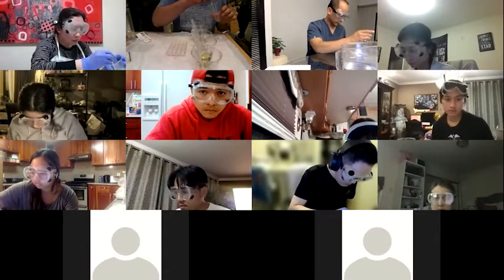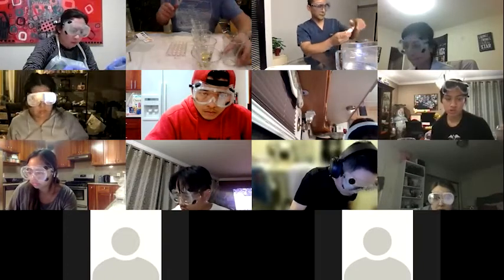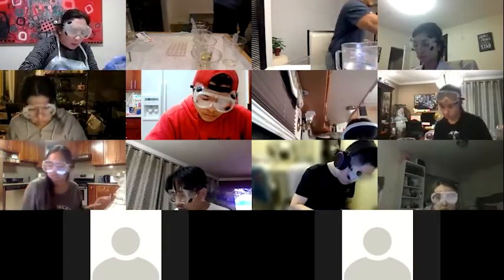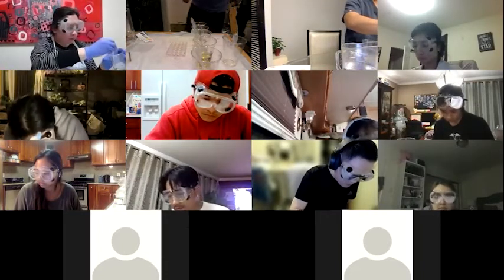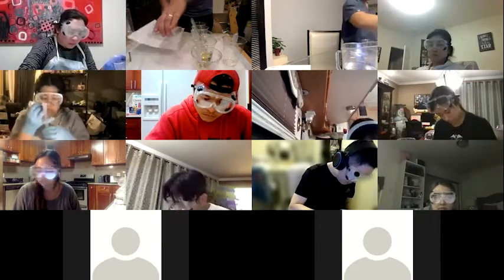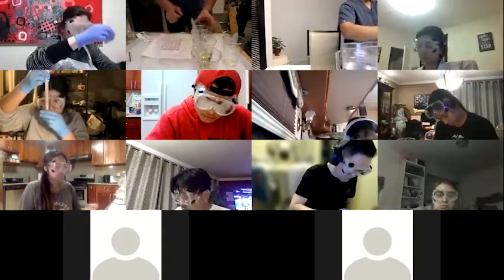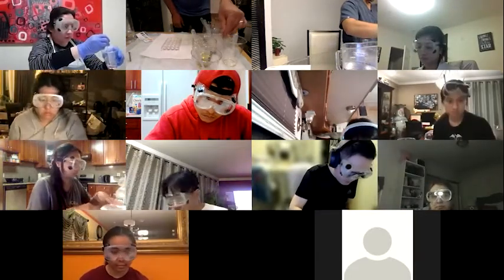Okay. So I'm going to get a nice clean sheet of paper, put the plate on top. Move some stuff out of the way to get rid of some of these shadows.